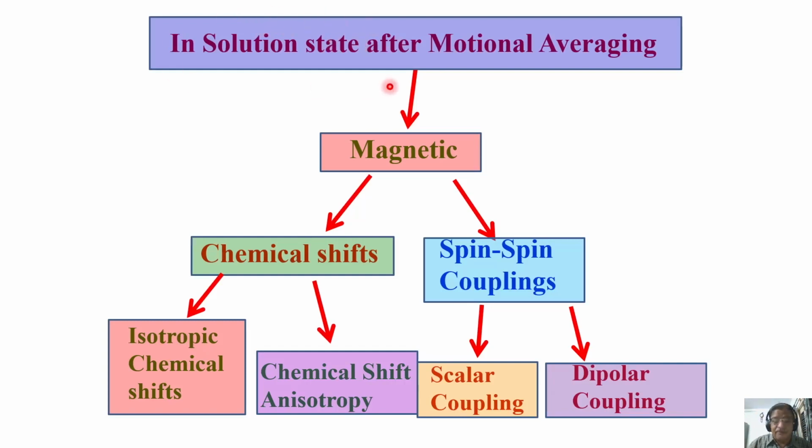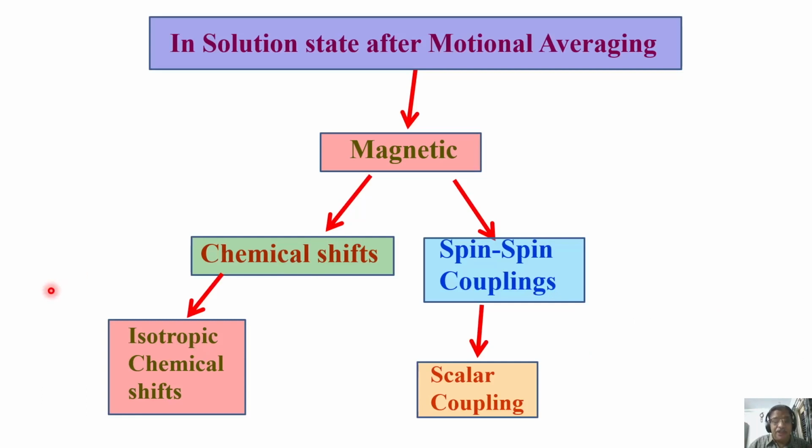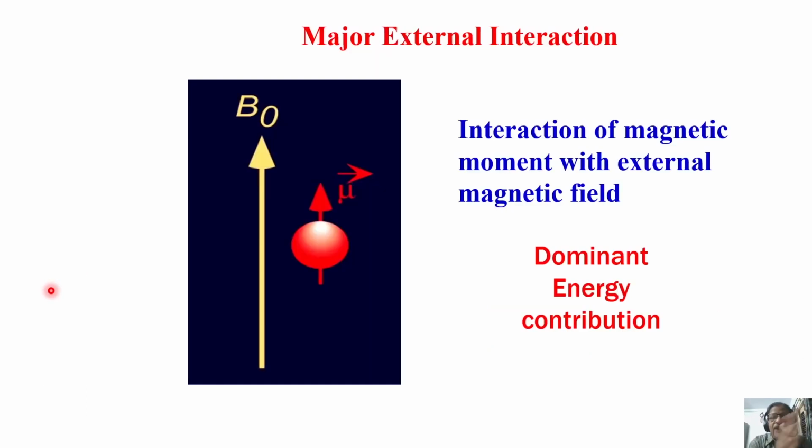In solid state, where there is no motional averaging, all these interactions are present. Now in the solution state, we'll talk about only these two parameters.